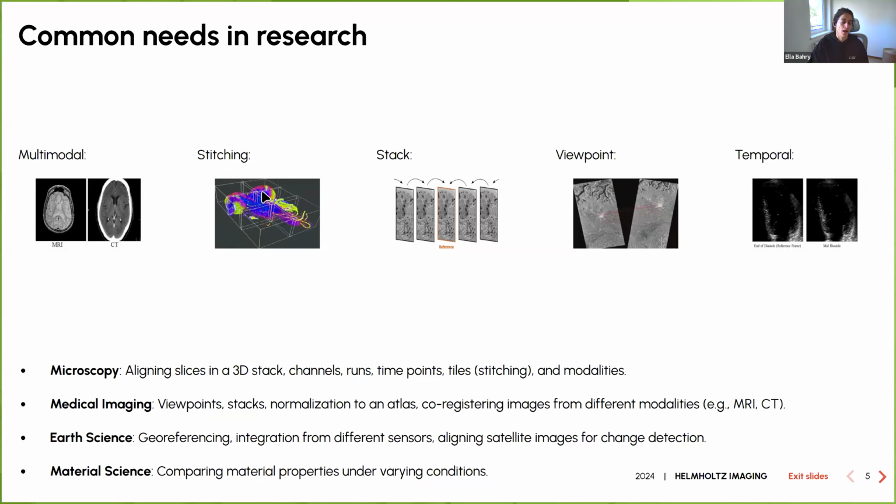And today we also have, for instance, microscope tools or other sensors that already have this information in the metadata. They know exactly which angle and which position each tile was taken from, and you don't need to rely on the image information to do the stitching.